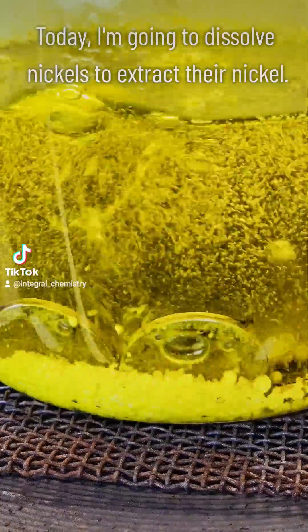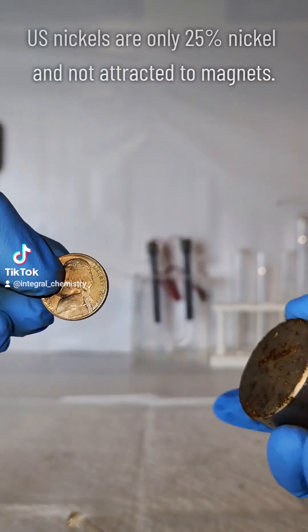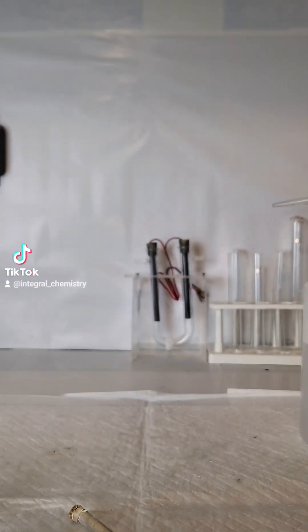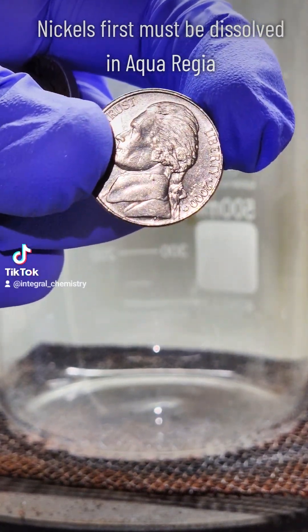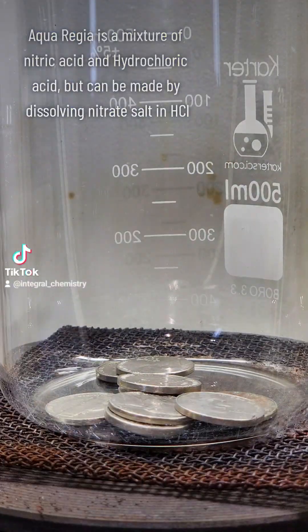Today I'm going to dissolve US nickels in acid to extract pure nickel metal. Modern US nickels are about 25% nickel metal by mass and are not attracted to magnets, even though pure nickel is. The other 75% of nickels are copper, and to separate the two I need to first dissolve nickels in aqua regia, which is a mixture of hydrochloric acid and nitric acid.